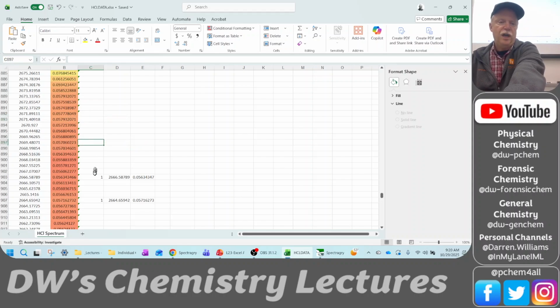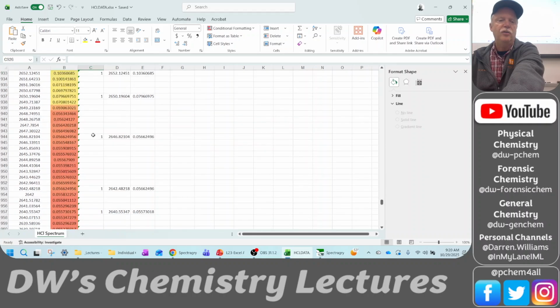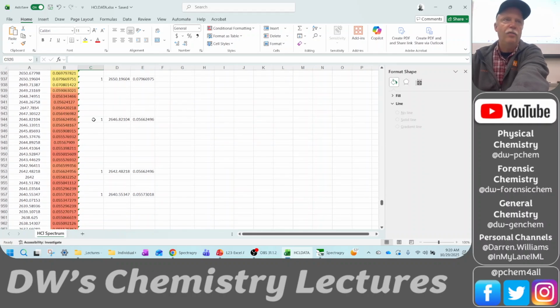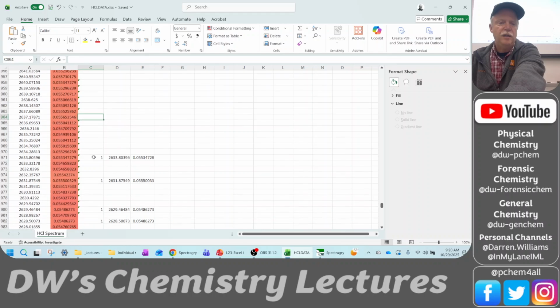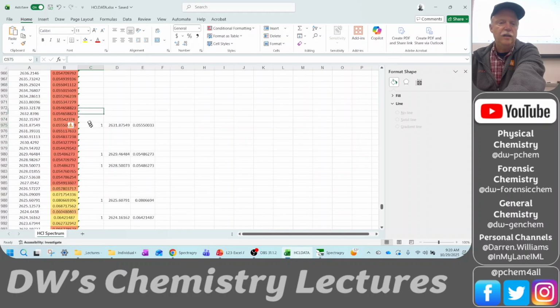Okay, and so this I found was a lot easier on my brain, because I'm not really using a lot of mental activity to delete these. I'm just looking at the red region, between lines, and I can get rid of them. I'm not having to scrutinize 0.13 and 0.14 and 0.12 to try to find the maximum. Okay. It's still a bit tedious, but it's a lot less tedious than hovering the mouse over the plot.